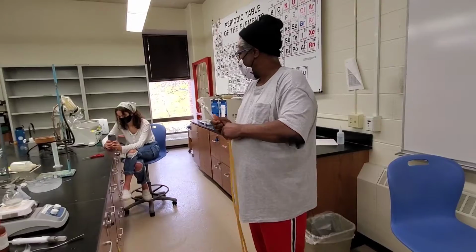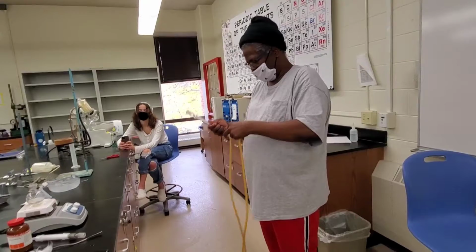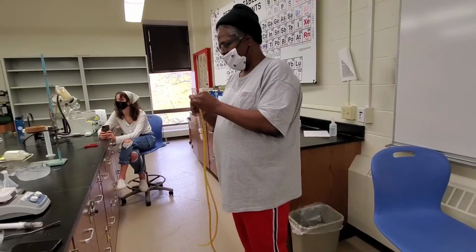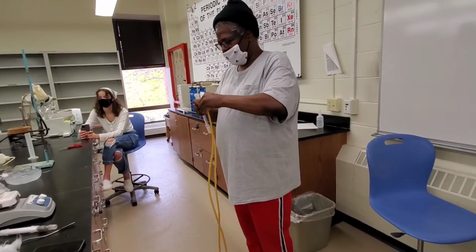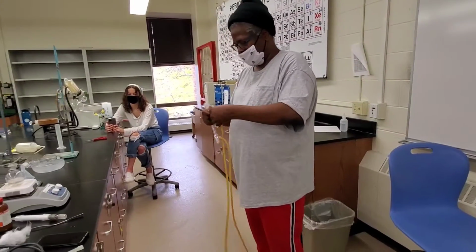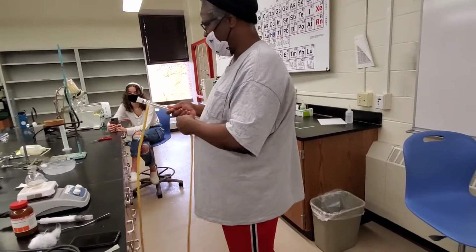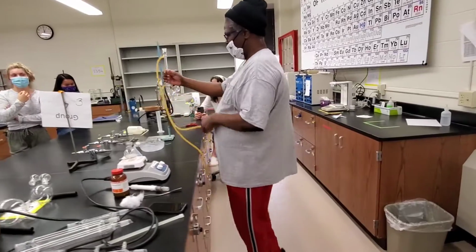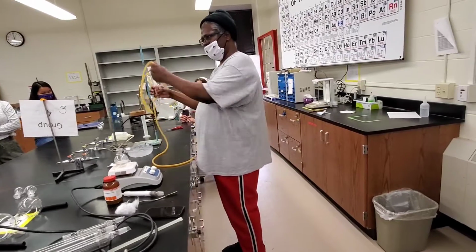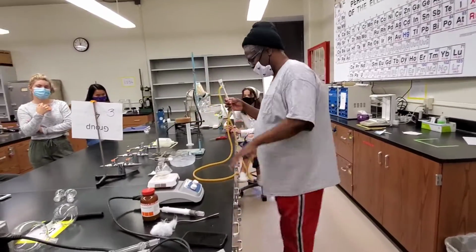I don't have a water flow here, a tap on here, so I'm going to have to show you this next one in a hood. Anybody know where the water is going to come from? The bottom. Yep, it flows into the bottom and out the top. And once you get comfortable, some of you are going to set up series of reactions where water coming from the tap is coming here. This top one could then go into the bottom of another condenser and flow out into another one. It could be like a series.